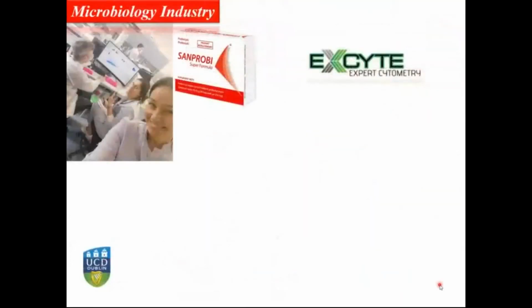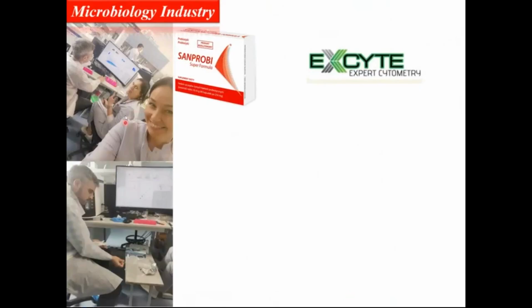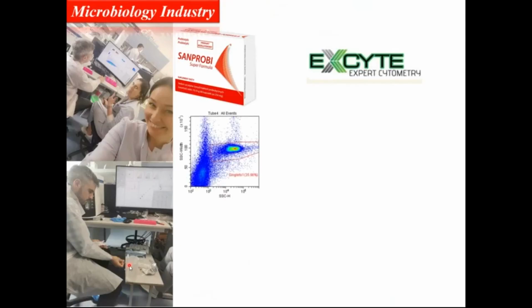Now, in terms of how we sort, and how easy it is to sort bacteria, because there's contamination, this is something that we have done with a collaborator that we have in Poland. In this case, they got the sorter. As you can see, they are having good fun, and Michał was preparing the samples just there. As you can see, the sterility of the environment is quite low. What this group wanted to work with is probiotics. They're preparing probiotics, so they're very interested in microbiology.